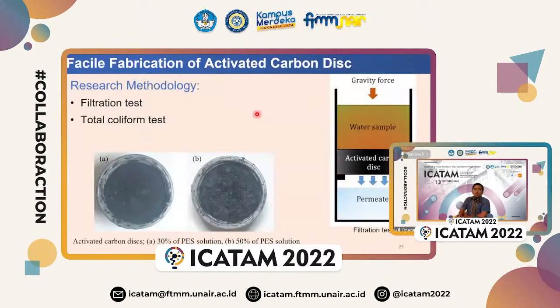So we did some filtration tests. Actually, this one is based on gravity force, just like the ceramic membrane. We just put the water in the container, and then we leave it for a few minutes, and then we have the permeate water here. And then we test the permeate water for filtration and also the water quality from here.